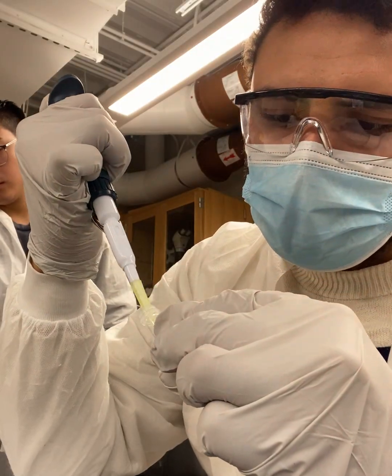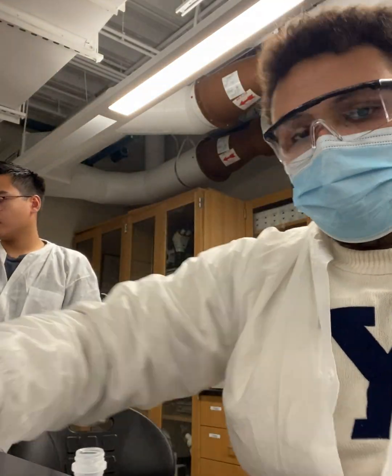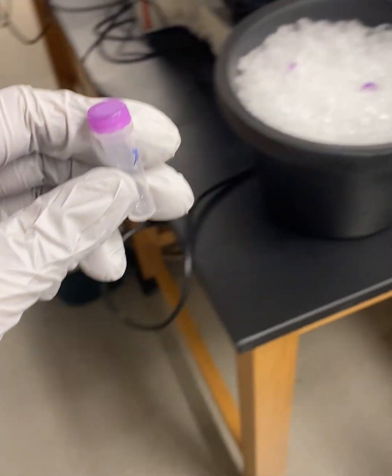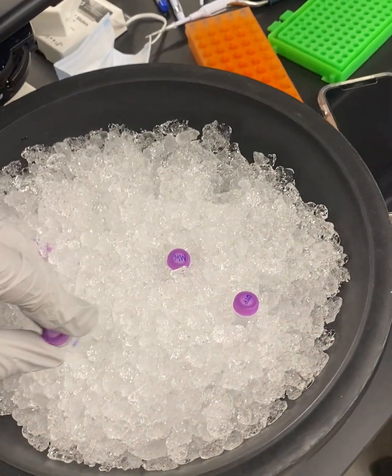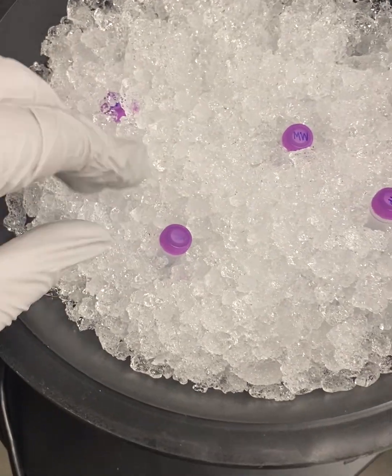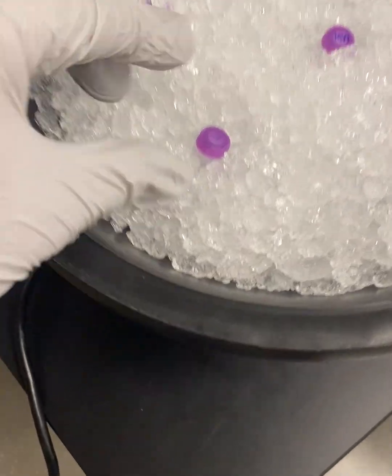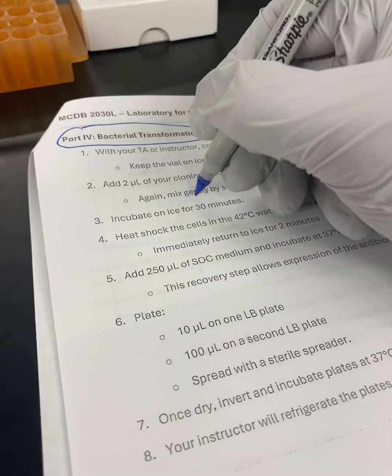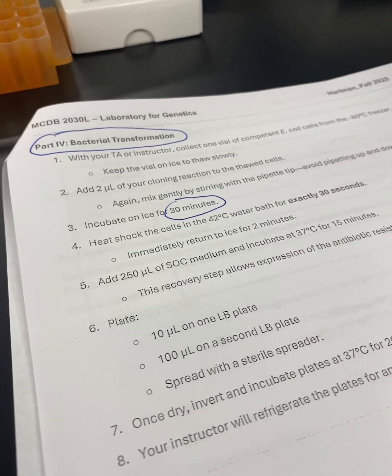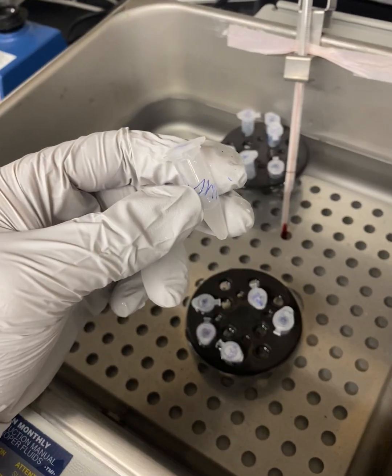Next, we perform the chemical transformation using TOP10 E. coli, using the calcium chloride heat shock method. These cells remain on ice for at least 10 minutes before use because the cold stabilizes their membrane and prepares them for DNA uptake. We add 2 microliters of our TOPO reaction directly into 50 microliters of ice-cold competent cells and flick gently to mix. The tube stays on ice for 30 minutes, allowing the plasmid DNA to associate with the chilled bacterial membrane.